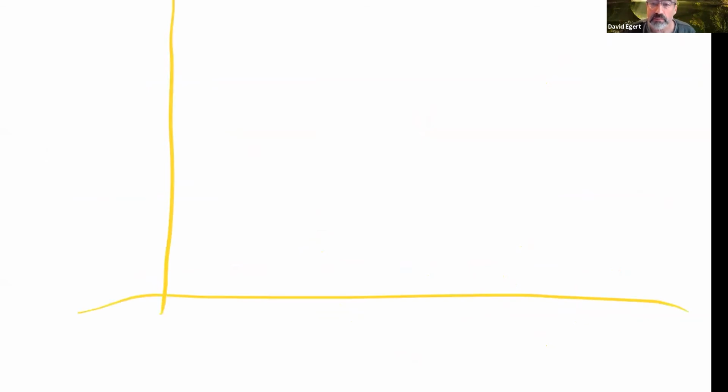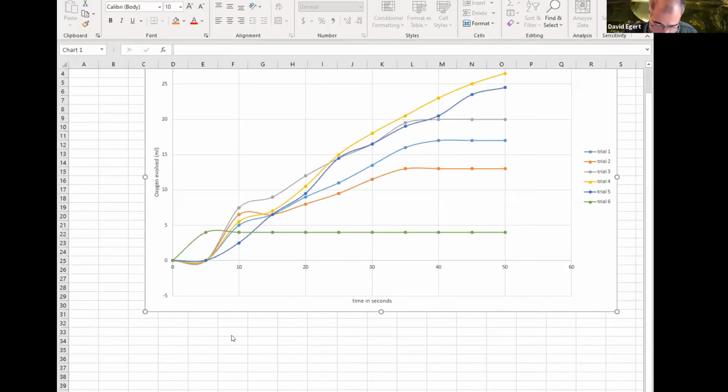As to the question someone asked a little earlier about doing them all on the same graph, you can. A nice thing about doing that is you can see them, compare them, and see how they look compared to each other. For instance, I'm going to share part of the reason I know something is weird in this data that I was printing from the earlier group. This is actually helping me realize what's up here.